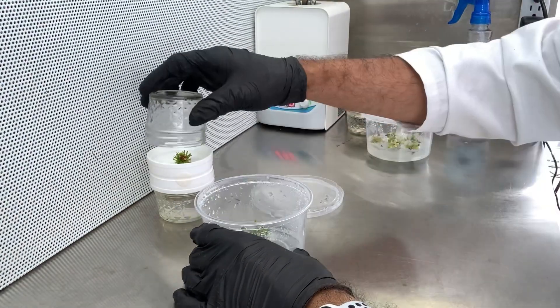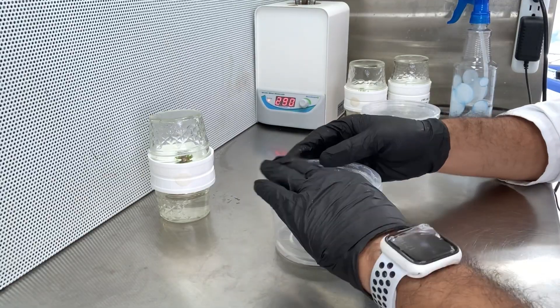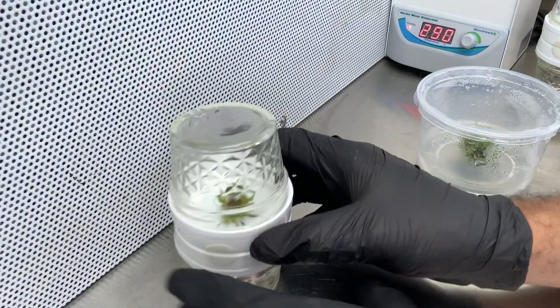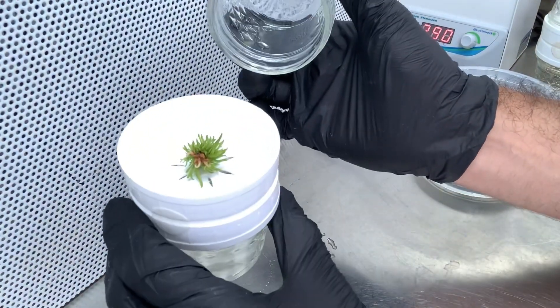The biocoupler has proven successful with many plants including orchids, cannabis, aquatics, succulents, ferns, and carnivorous plants, and the list will be more extensive in the future.